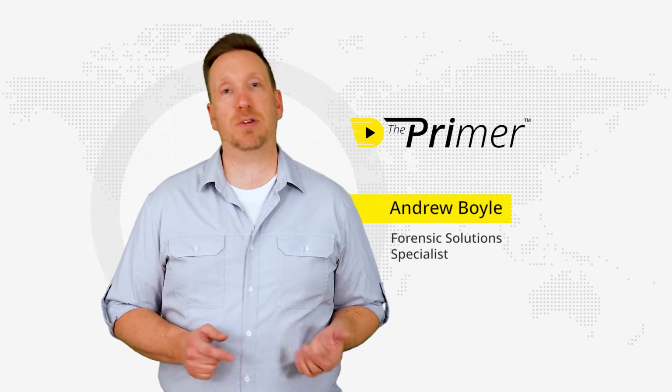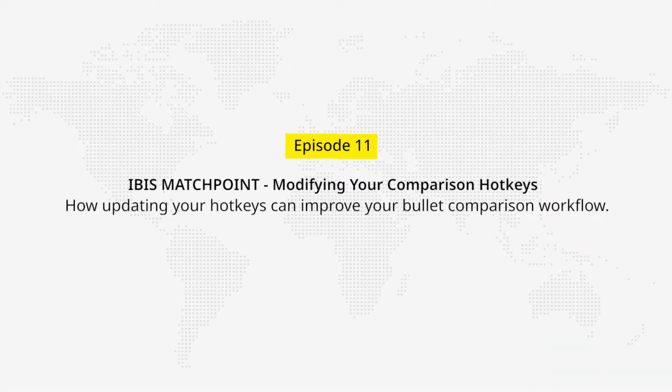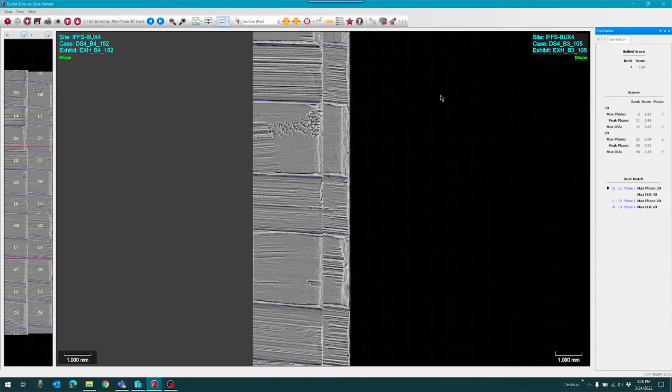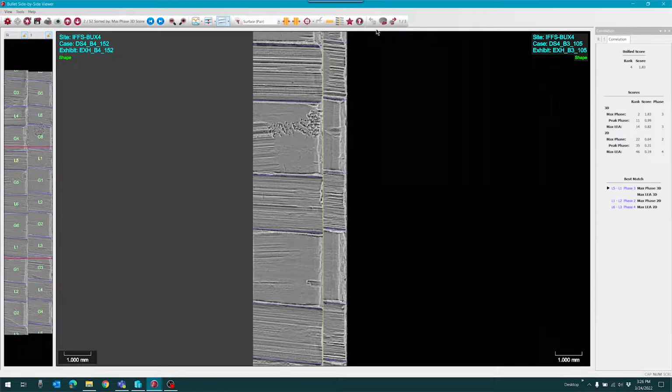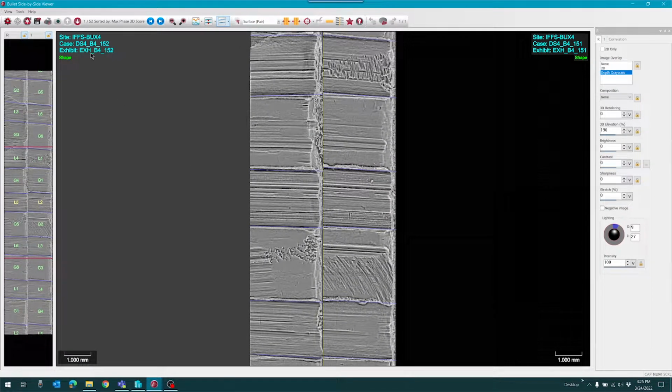This is a video how-to series on the Forensic Technology product line and some tips and tricks on how I think you can best use them to get the most efficient use out of them. In today's video, I want to show you how you can use the hotkeys instead of clicking your mouse on certain buttons. The keyboard can be used, and you can actually personalize what you use those keyboard buttons for.